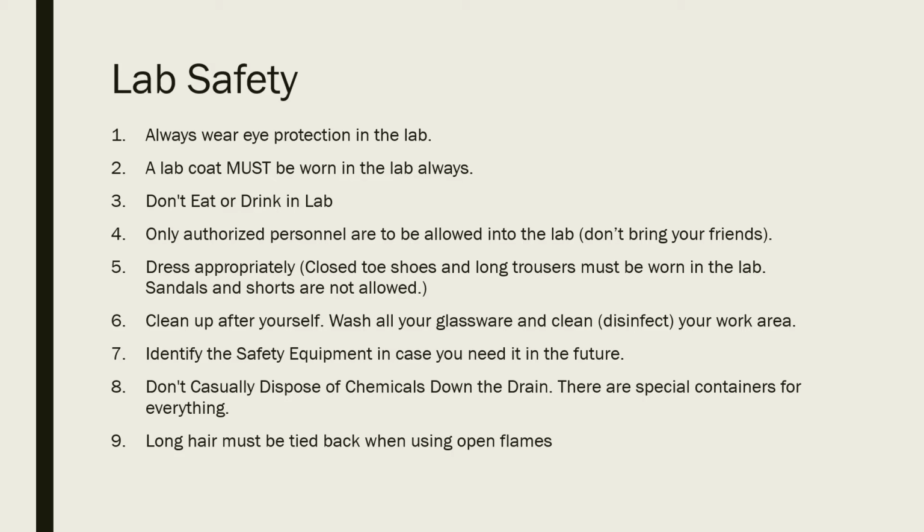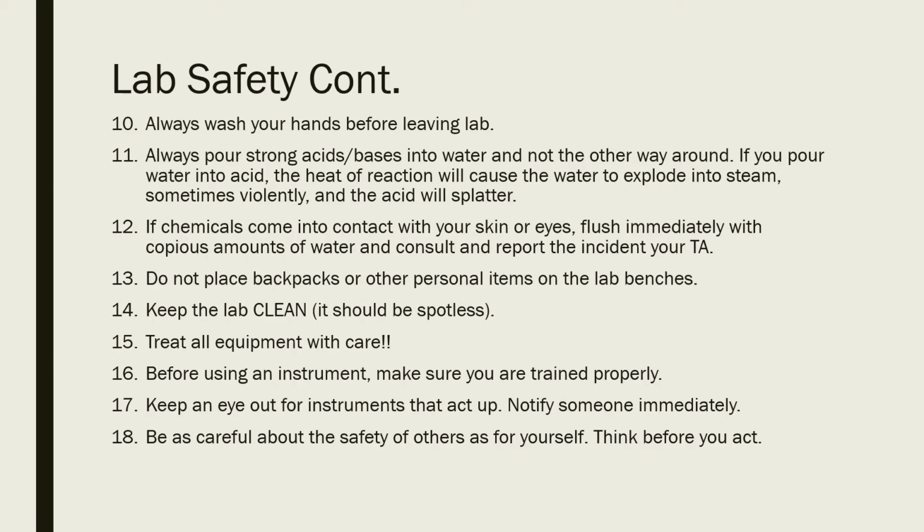For people with very long hair, you want to make sure to tie things back. This is mostly so that it doesn't get burned whenever you're working with an open flame or come into contact with chemicals. Also, you don't want it to land on your experiments and contaminate them. Just a couple more. Always make sure to wash your hands. We don't want to let chemicals leave the lab and contaminate the outside and get someone else sick.